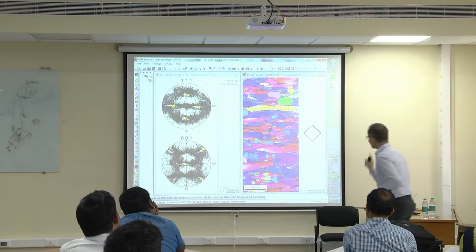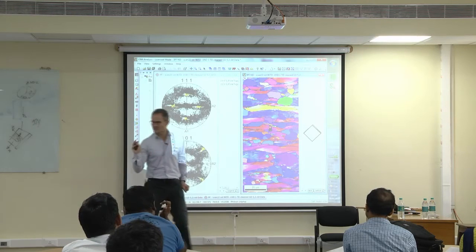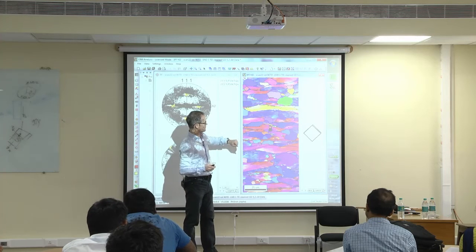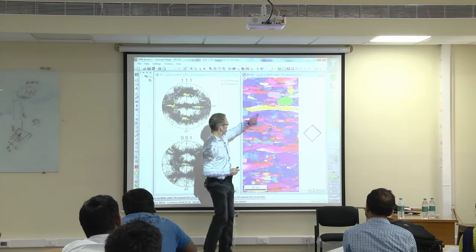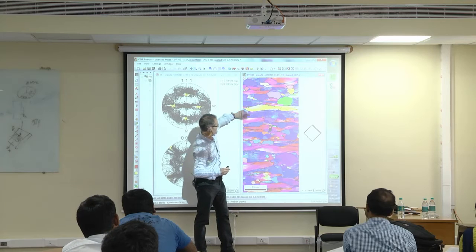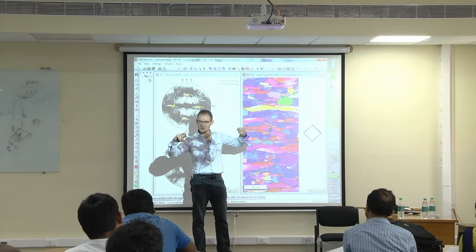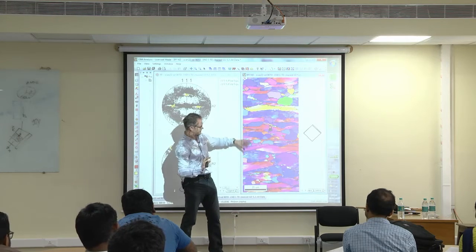And you see already one interesting thing. Now we learn a bit about material science again. When you look into the deformed structures, and we will later on find out how we look into that, you see the blue ones, you can see some substructure. Yeah, you see pink, blue, pink, blue, pink, blue. There seems to be some substructure inside. While when you look in the red one, you don't see this clear substructure.